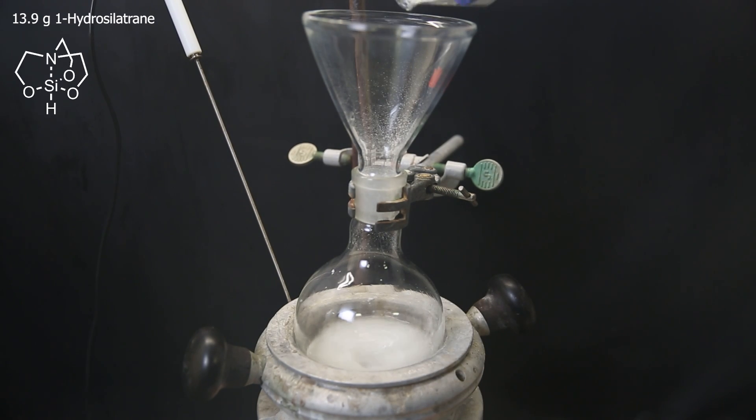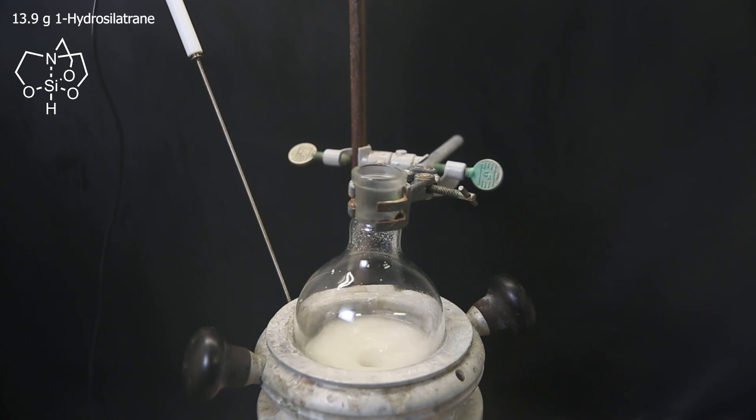Now for this reaction, I will try a new reagent called hydrosilatrane that I made in my last video. And I want to see if it works well as a replacement for sodium cyanoborohydride, which is normally used for this reductive amination as well as many others. And then leave it to stir for 3 hours at 25°C.